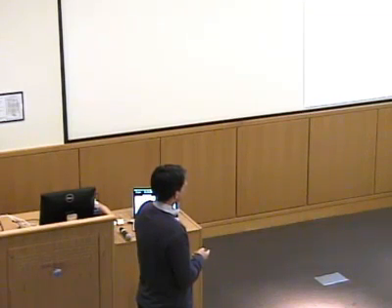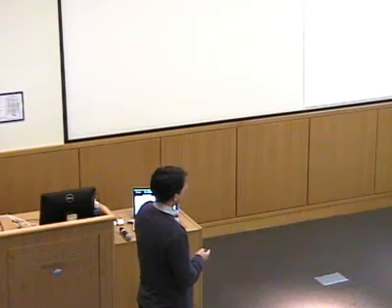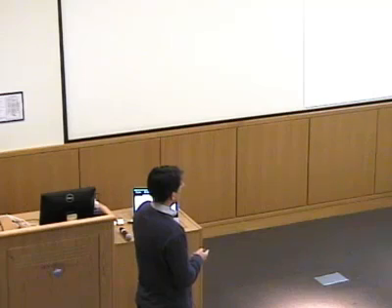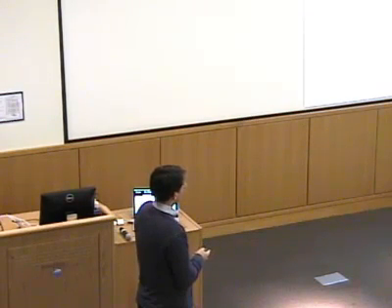So here you have the resonance Raman spectrum at 676 nanometers, so that is out here. There is not much of a response. Now you start to zoom the laser into this absorption band, and you will find a strong vibrational band at 816 wavenumbers. Now, if you do the labeling experiment with O18, you will find that this vibrational band moves by 5.7%, as it should. So that is an OO stretching vibration, the totally symmetric OO stretch that has this shape here. And that is strongly enhanced if you excite into this band here.